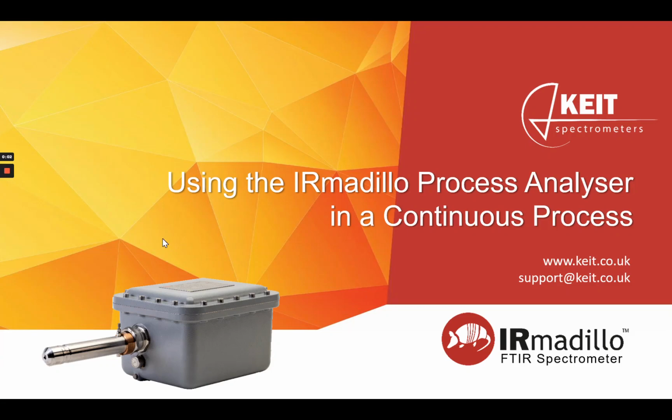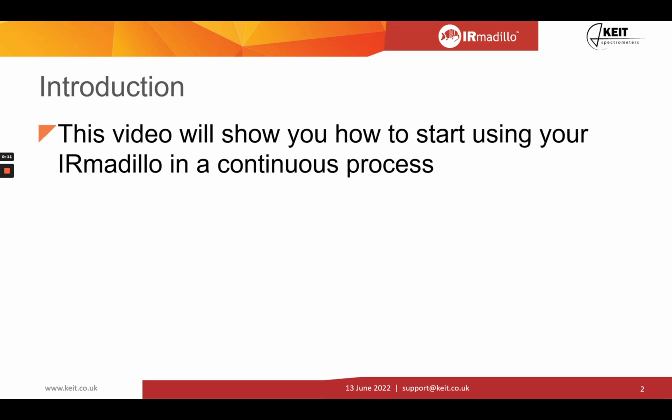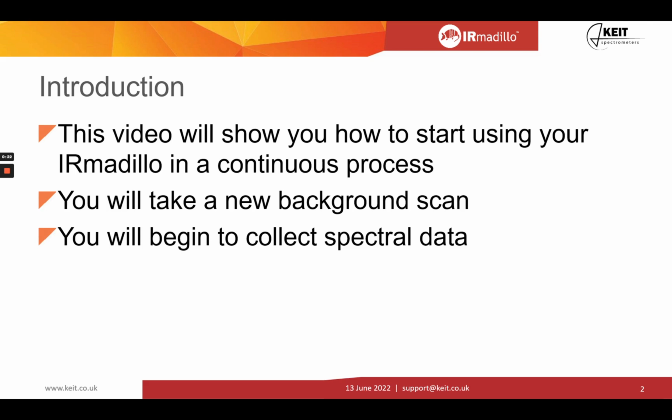Using the IRmadillo process analyzer in a continuous process. Hello. This video will demonstrate how to start using your IRmadillo in a continuous process for the first time. You will take a background scan, which is only needed for the first time that the IRmadillo is used, and you will start to collect spectral data.